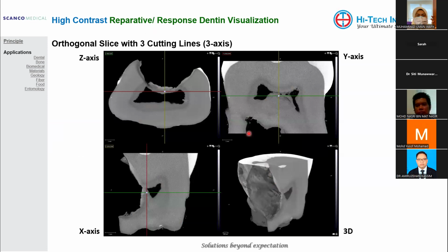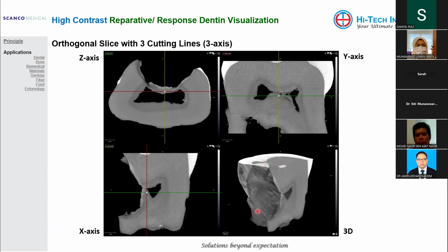So we have done just an ordinary scan. This is something that gives you the standard features of a MicroCT. You will get the XYZ and you get a 3D. And from the software itself, when you move around, going in and out, you will create a different 3D. So that's the standard feature. In the future, if you have an opportunity to do a real virtual demo of how the MicroCT works, you will have a feel of how it looks.